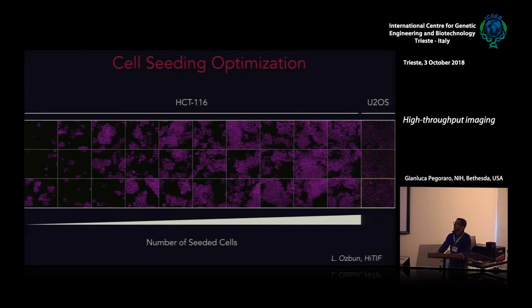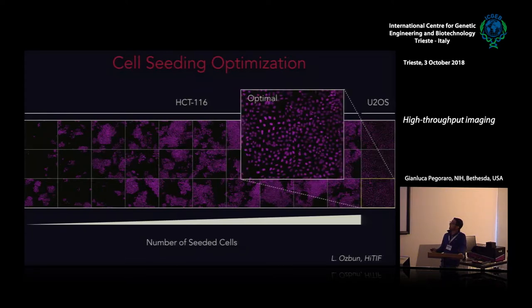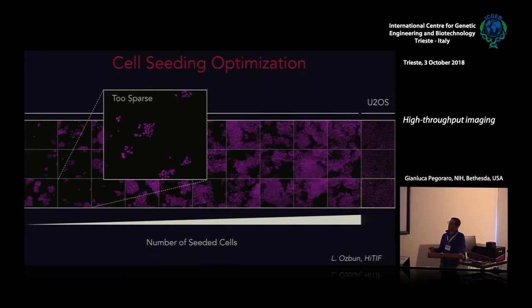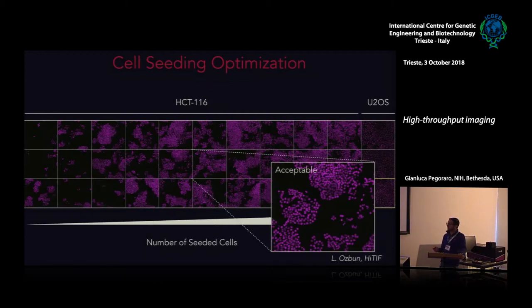One of the most important assay development parameters is optimizing cell density. This example shows a titration of cell numbers for a colorectal cancer cell line, HCT116, where we have an optimal cell density. Too sparse wastes time because the microscope acquires mostly empty fields of view. Too dense means cells are so packed that algorithms can't segment them. An acceptable density gives sufficient cells that the software can actually tell them apart.